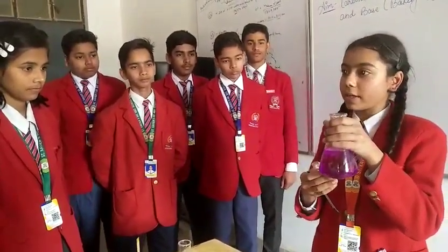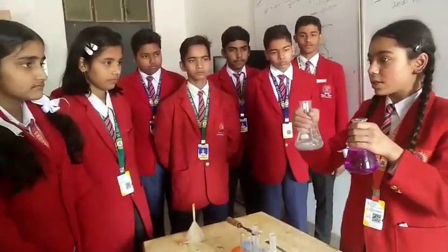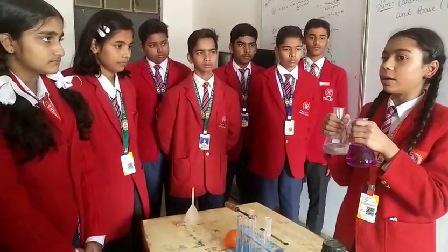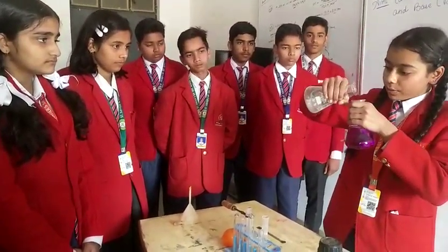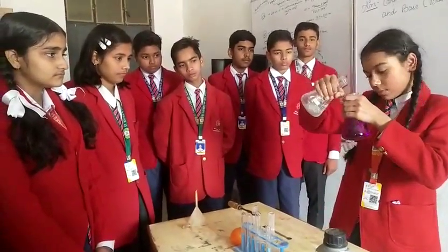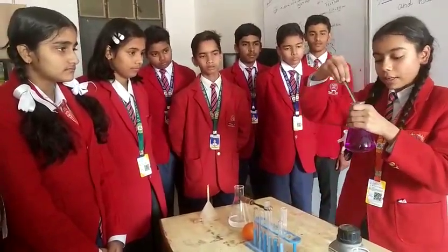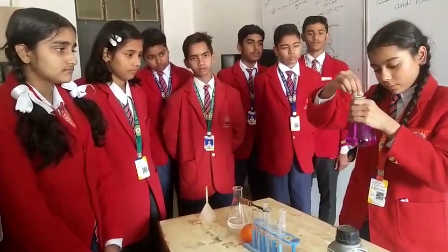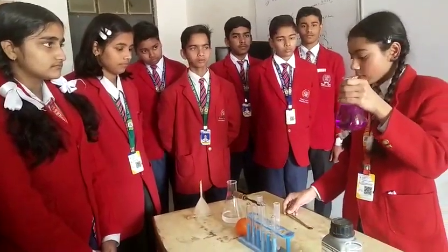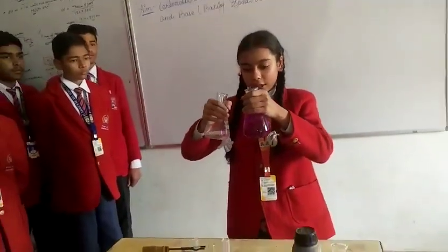Here is the potassium permanganate solution. Now when we are going to put some lemon juice inside it, it turns back into its original color like transparent water. So when we are putting some lemon juice inside it and mixing it properly, you can see that the color is now slightly changing.